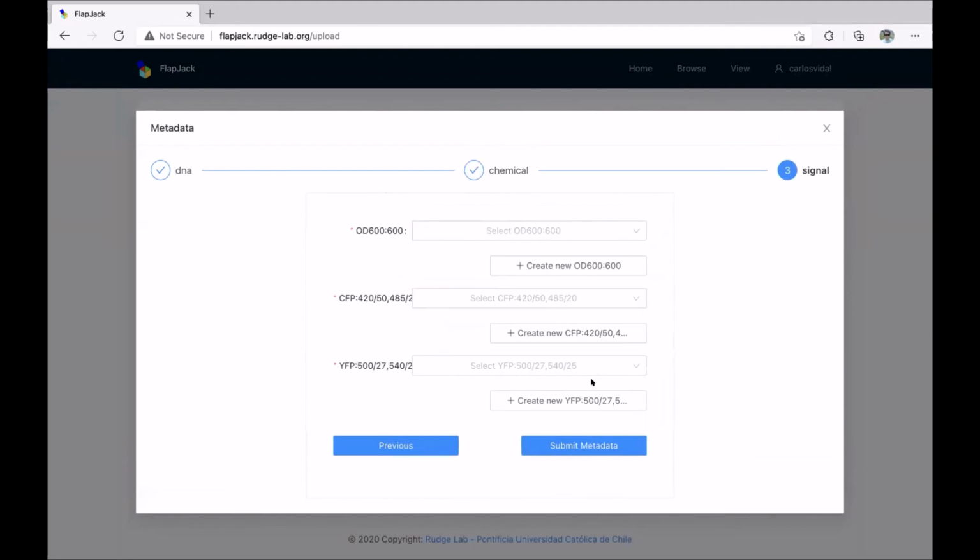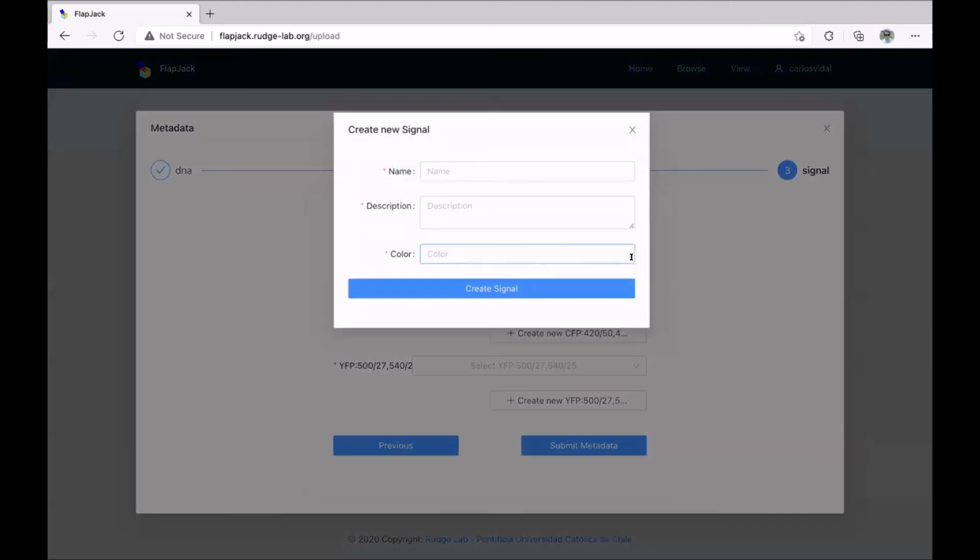It's not like specific fields for wavelengths that you could search, for example. But you could search the description, but it's just an open text description, so it wouldn't necessarily match exactly what you're searching for. But in principle, you could search a description which has a particular wavelength in it. All right, thanks.